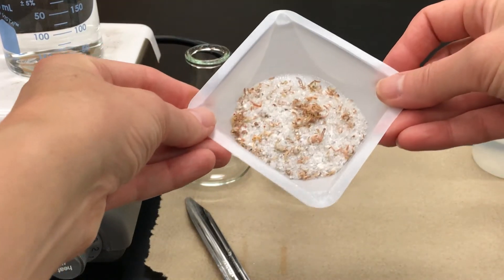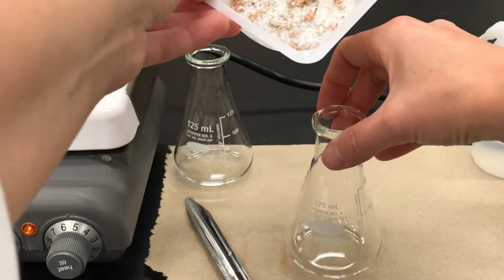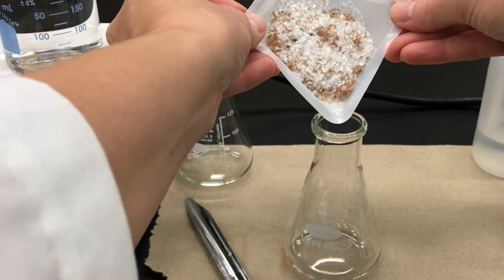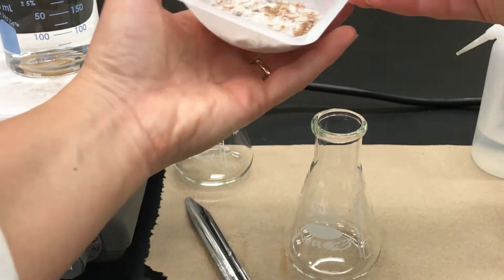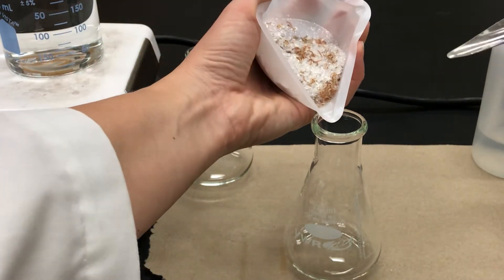Next I'm going to put my impure solid, which has all this junk in it, into one of the Erlenmeyer flasks. Since there's quite a bit of solid here I'm going to use a spatula to help me transfer that to the flask.